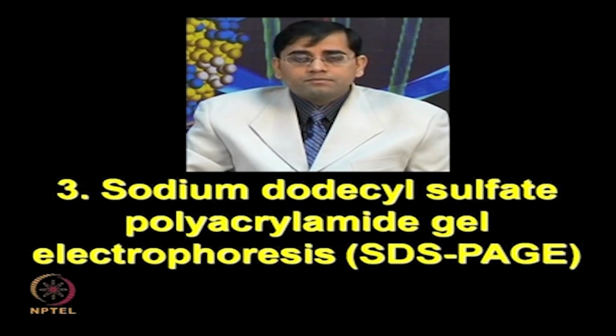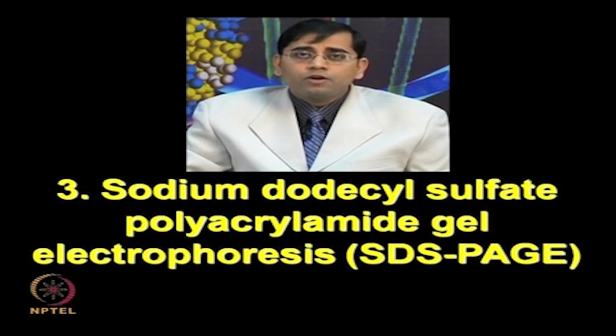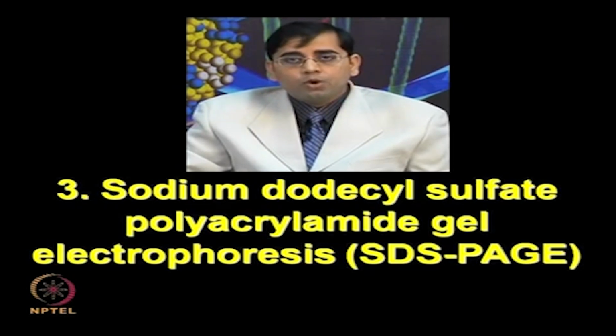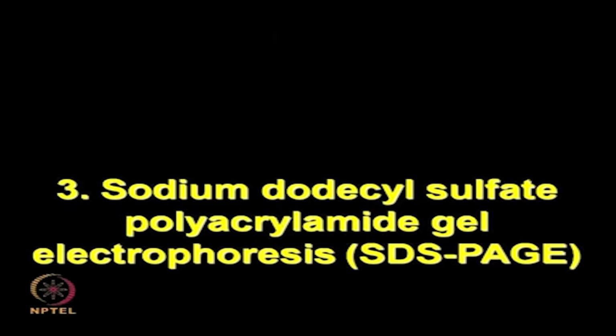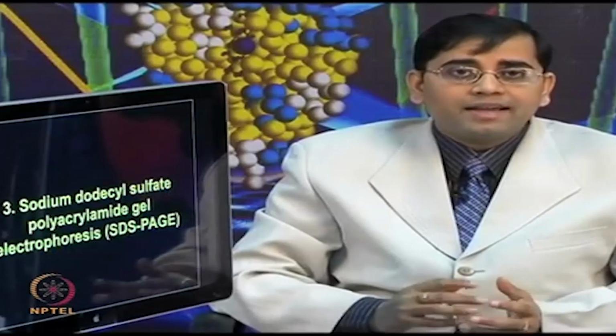As I mentioned, when you perform SDS page alone for separating your regular protein extract, then you need to add both stacking and resolving gel. Now, in this case, when you are using SDS page only in the second dimension of two-dimensional electrophoresis, then you do not need to add the stacking gel.